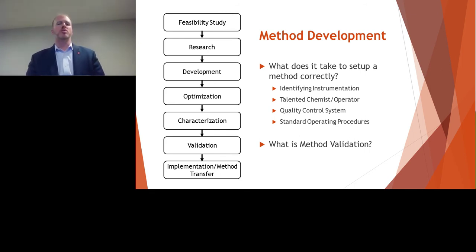And that's when you can really start your development and get it actually set up on your equipment itself. And then once you have the base method in, that's when you go into the optimization stage. That's where you're tweaking to really tailor your brand, really tailor your instrument in your lab to this method and to the clients that you want to serve.